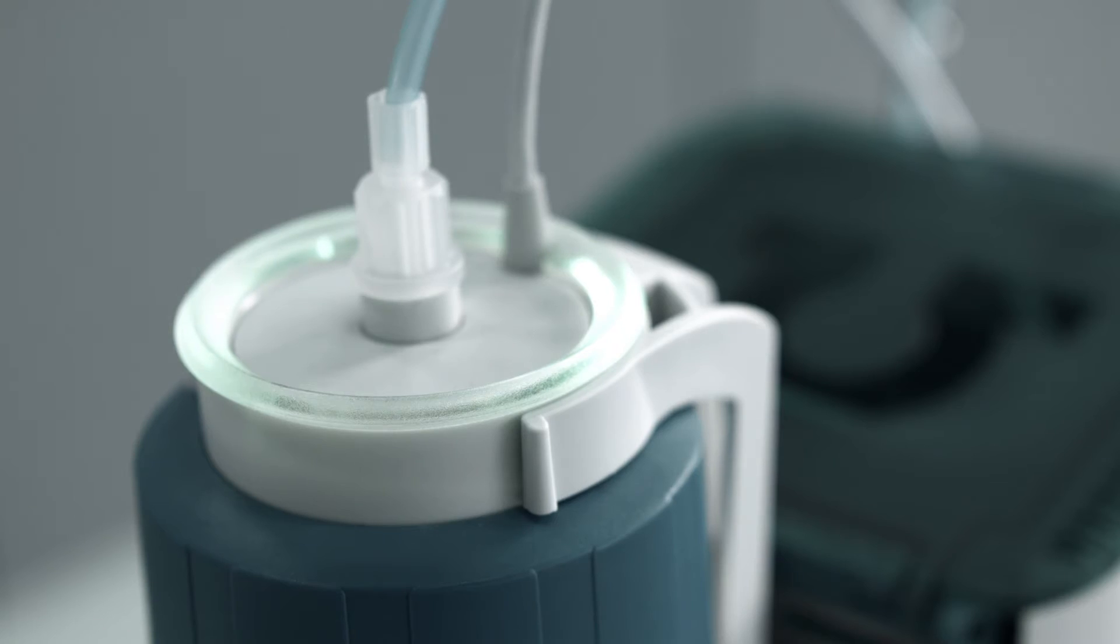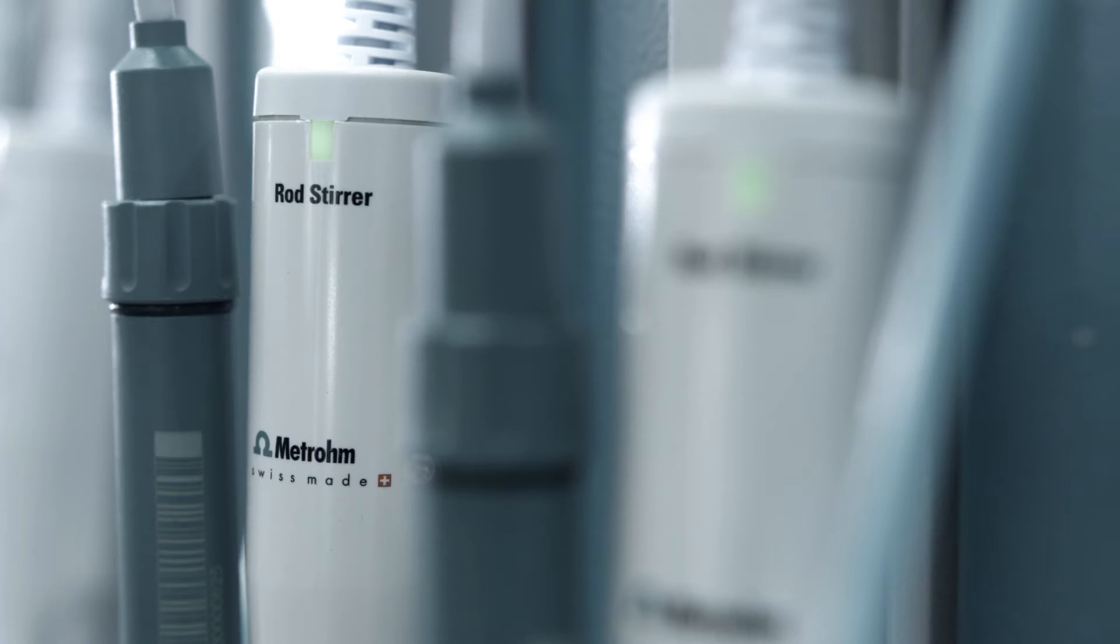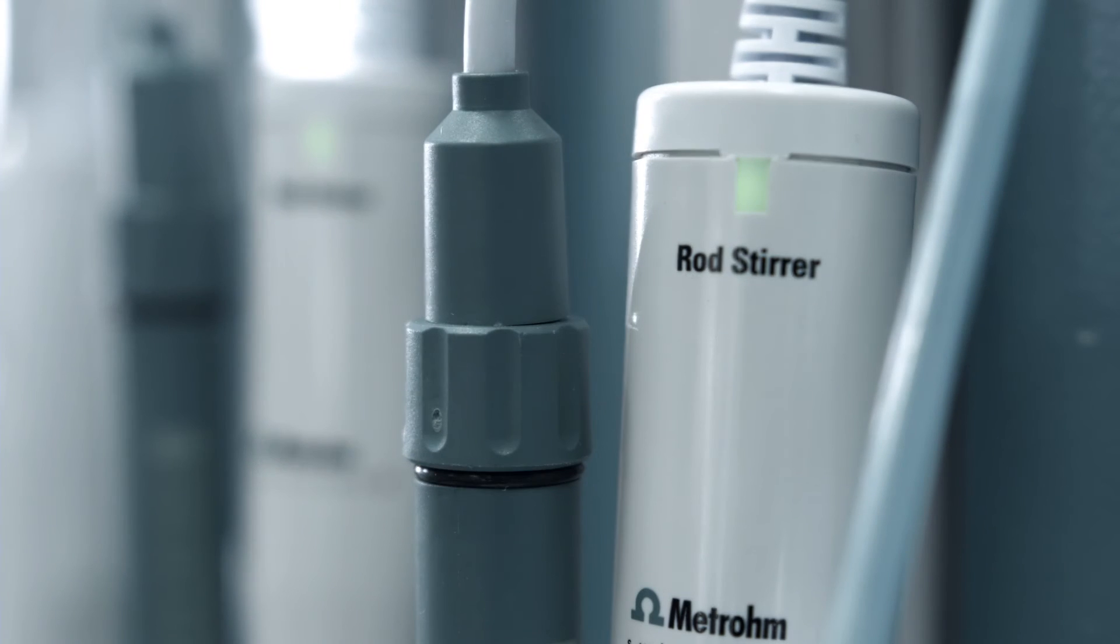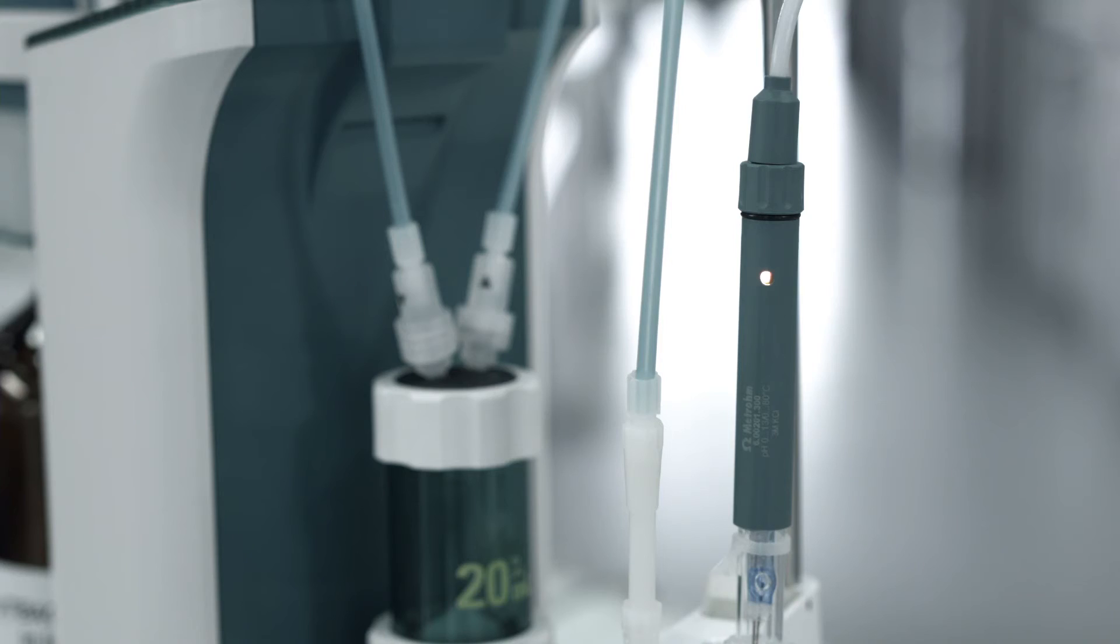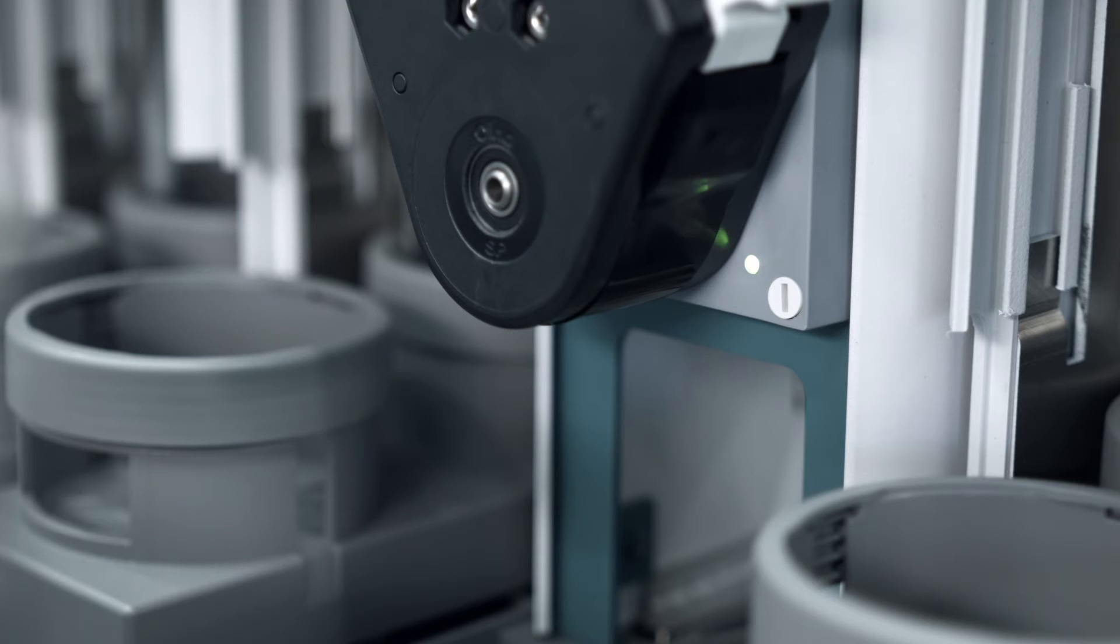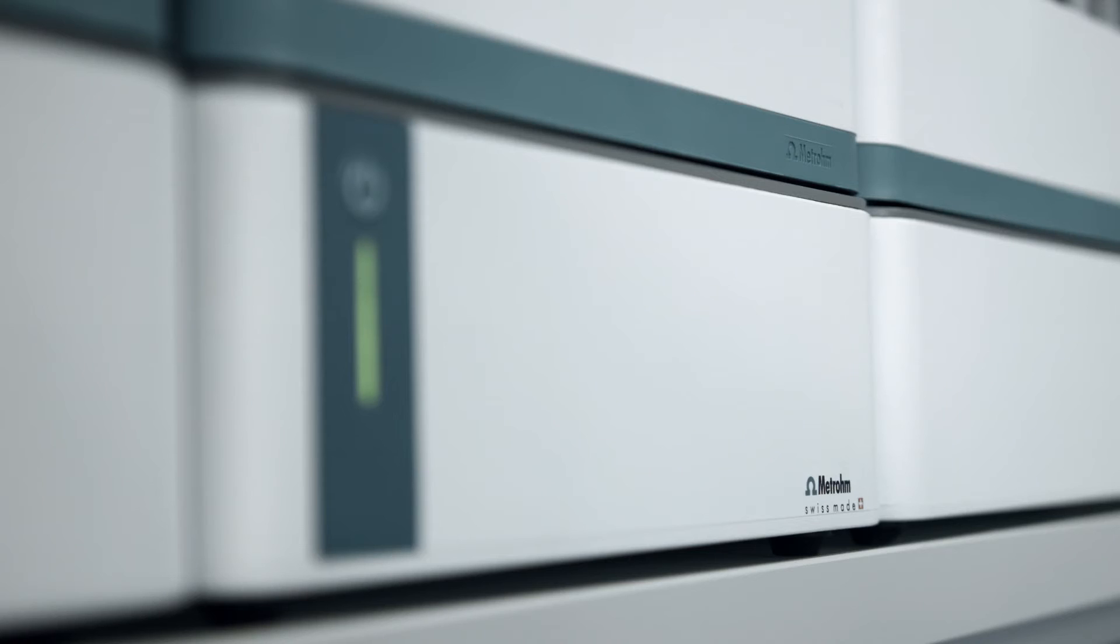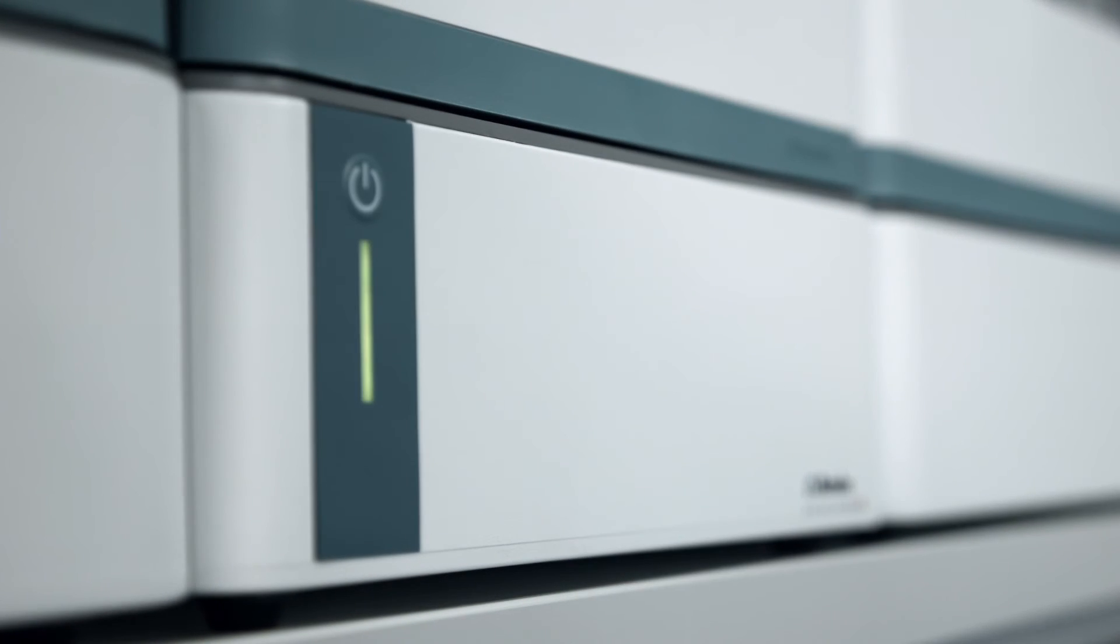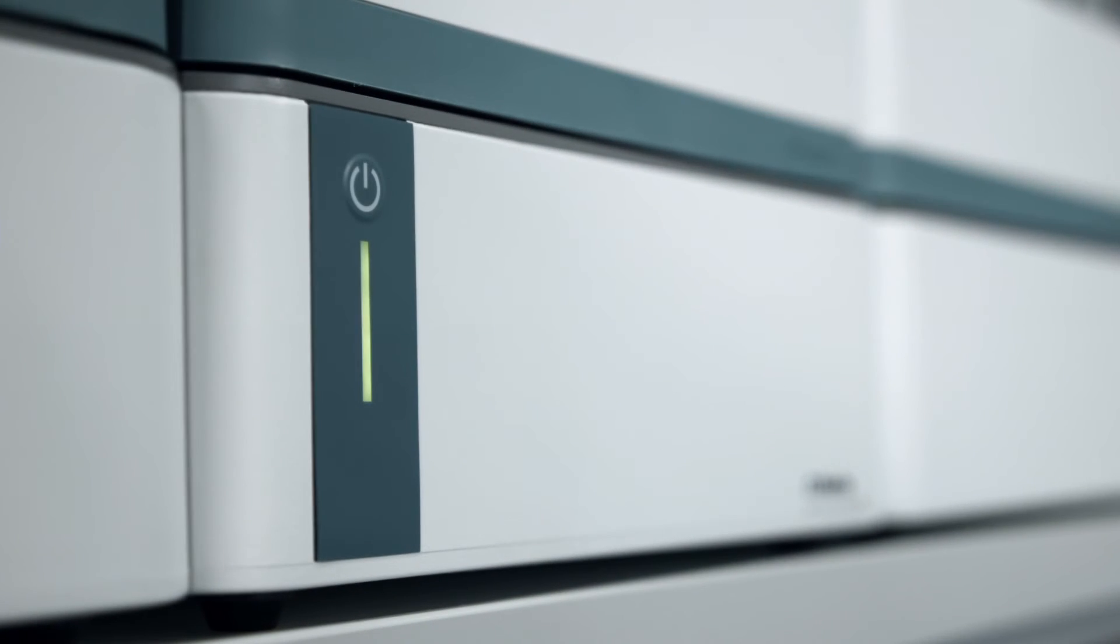The liquid adapter. The stir. The electrode. The pump module. And also the sample robot.